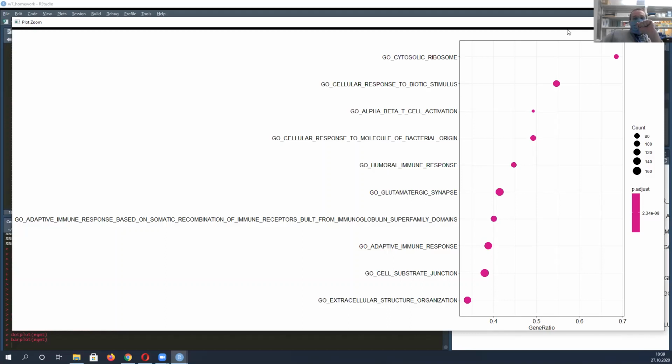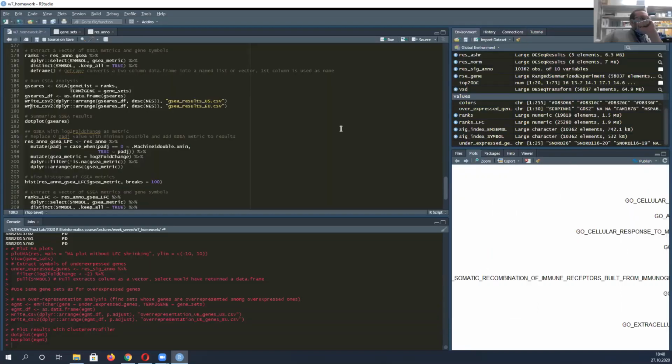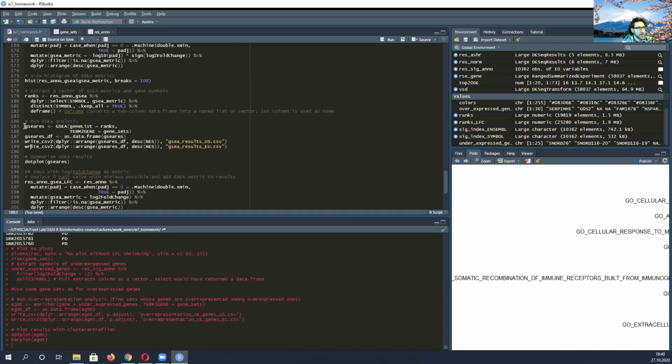What are your thoughts, Henry? You're muted. Can you go back to your data again? Where did you run your GSEA? Right here. Oh, there you go. Can you look at your GSEA res_df?